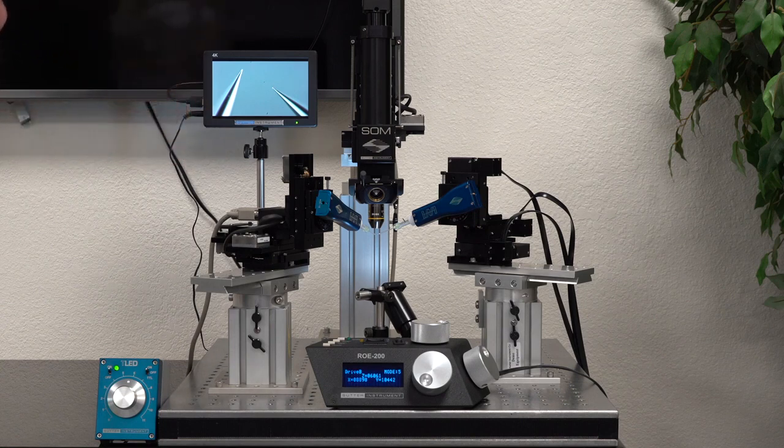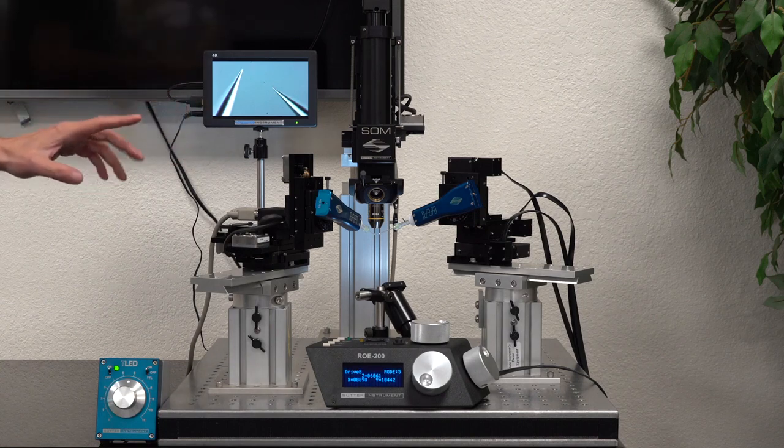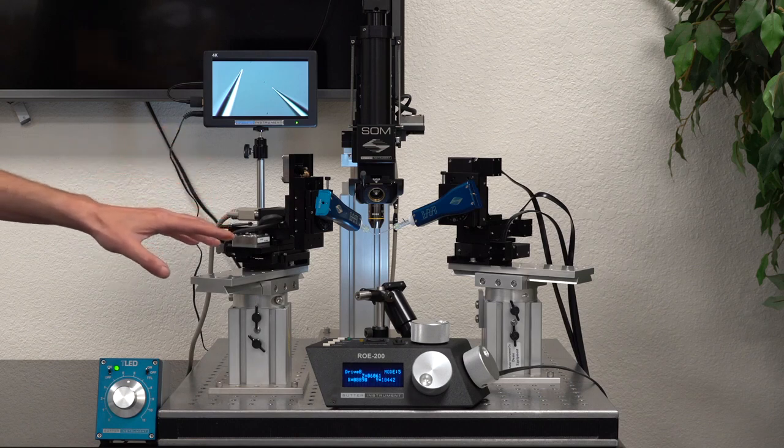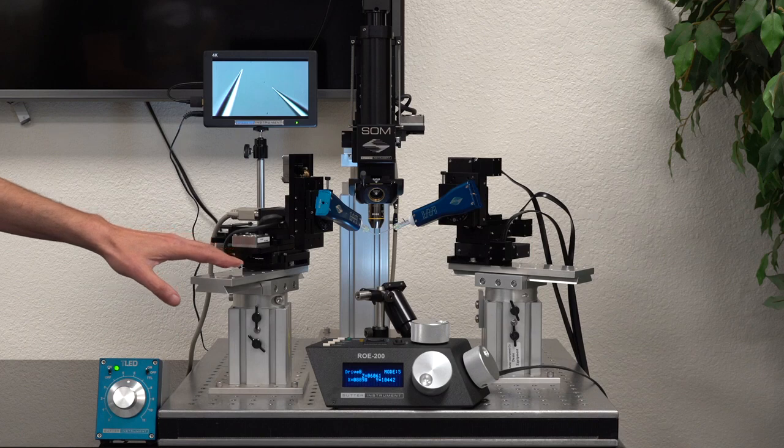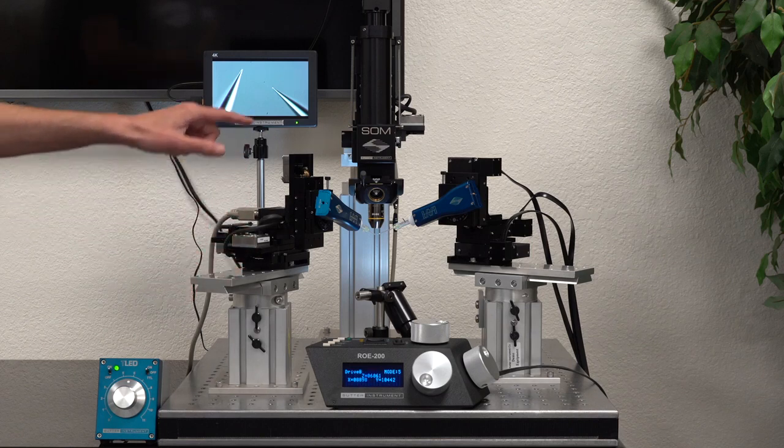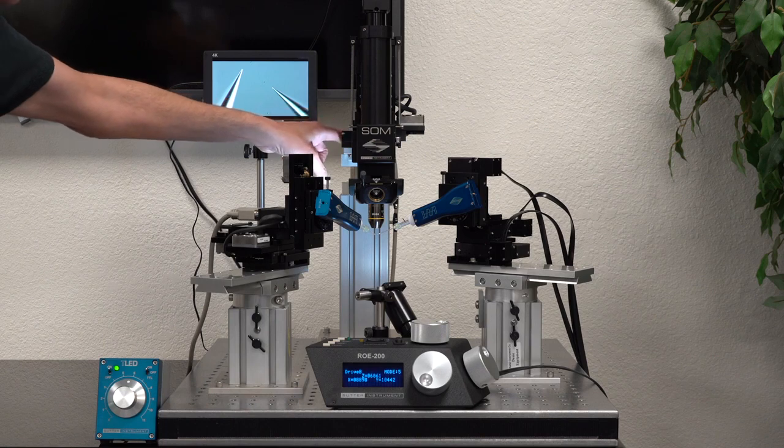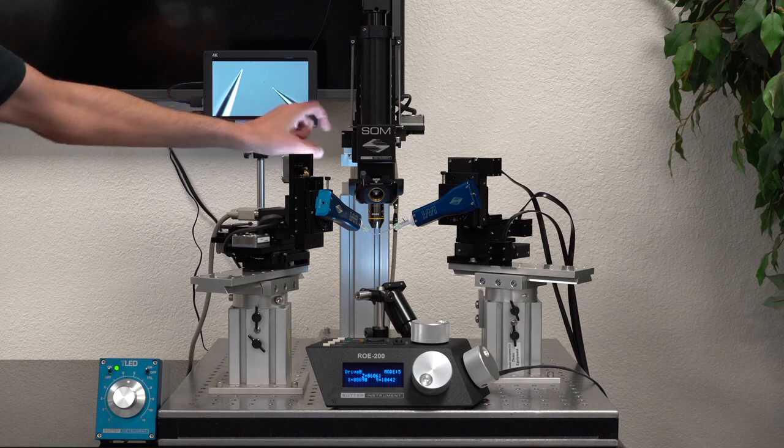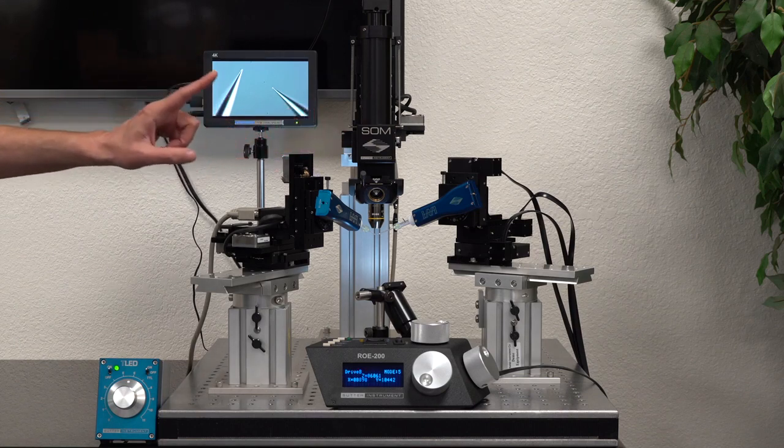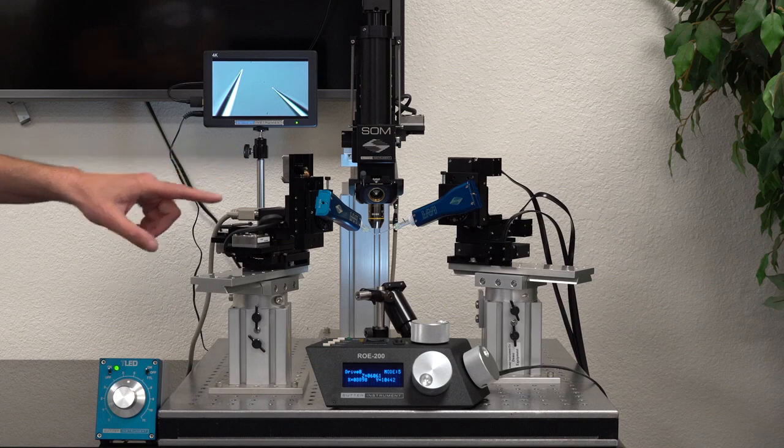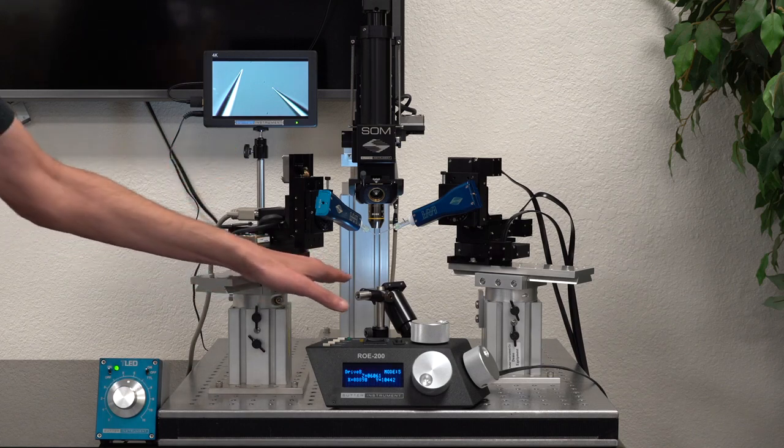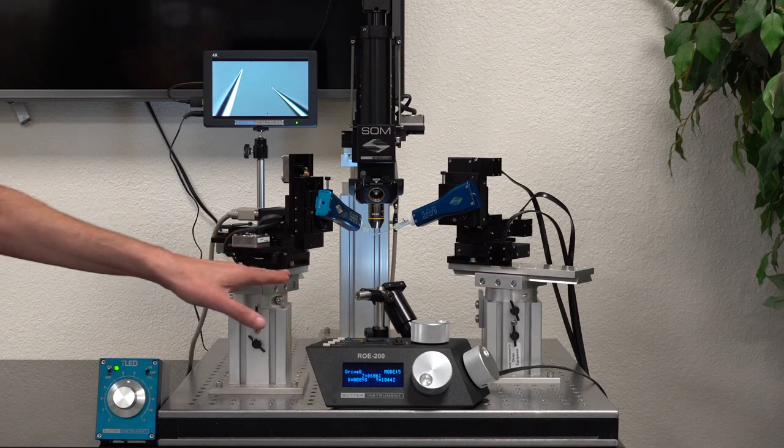I want to concentrate on the stands. In this setup here I am using two MT75 short stands for the manipulators and one MT75 T or tall for the microscope. Our stands are very useful because this stand here gives you the freedom to approach or come back. I call that the X-freedom.